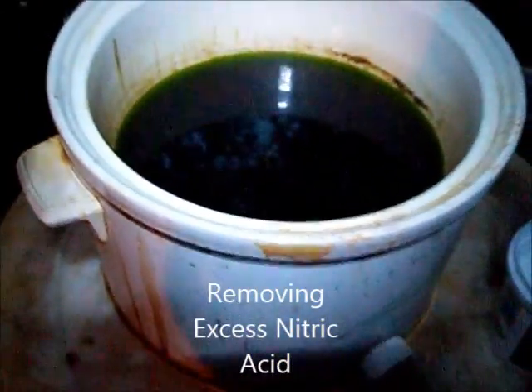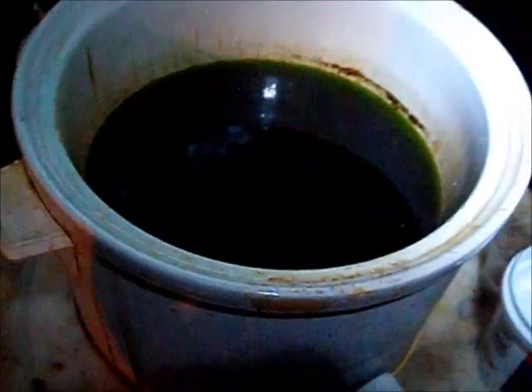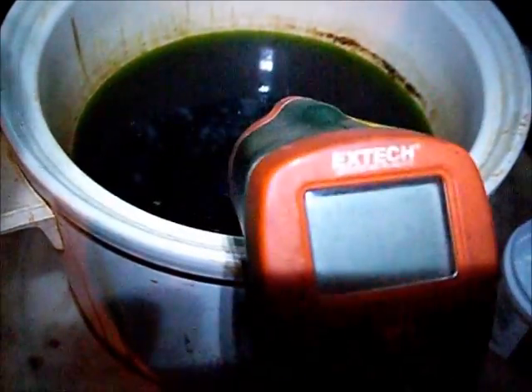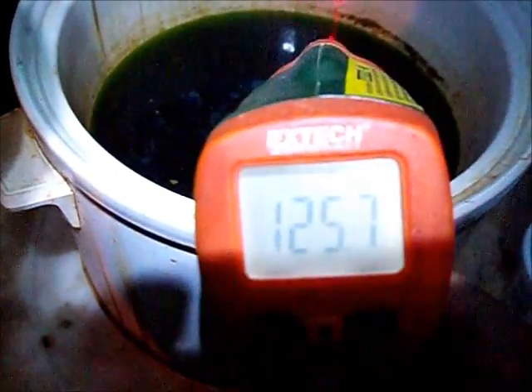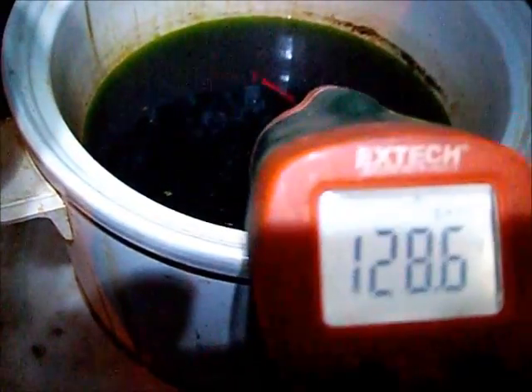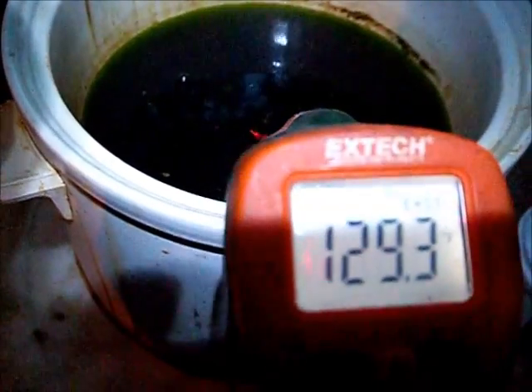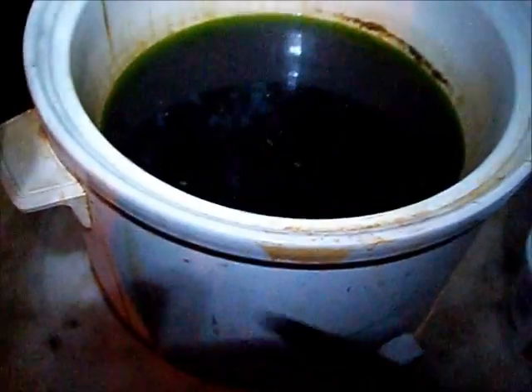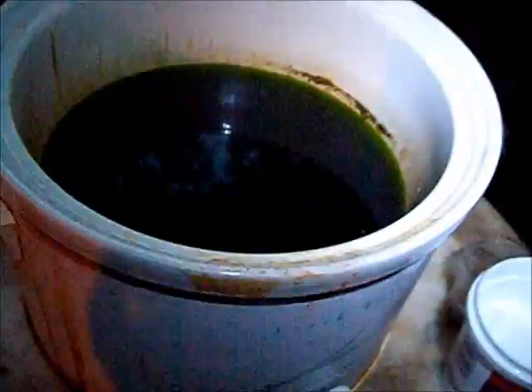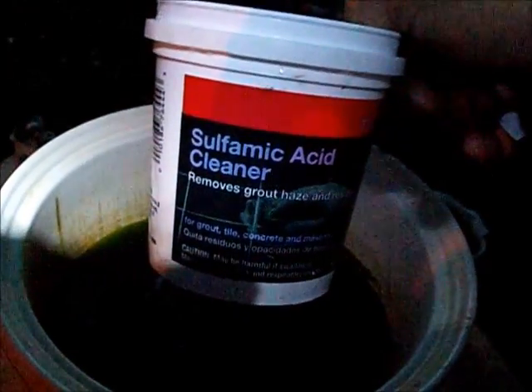I'm going to de-nox some solution here, or attempt to. Let's see if I can get this up. I don't know if you can see that, but it's 125 degrees Fahrenheit — 129, depending on where I hold it. Okay, so it's warm, and I'm going to be using sulfamic acid cleaner.